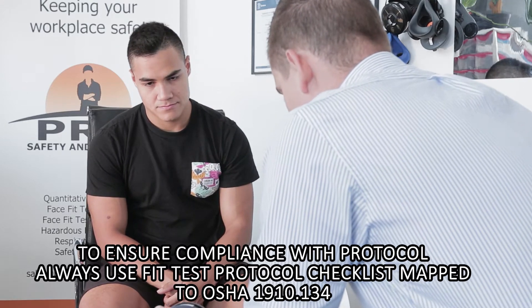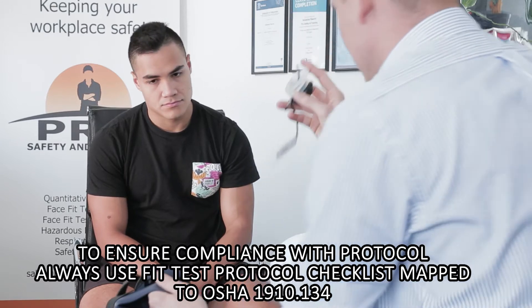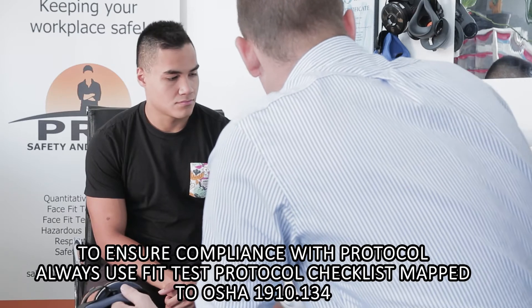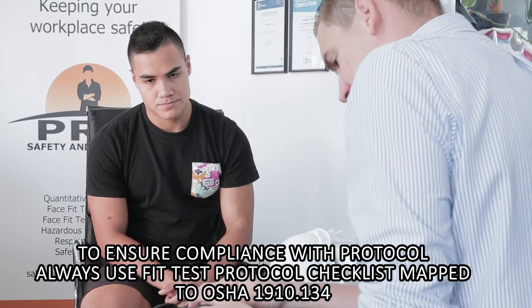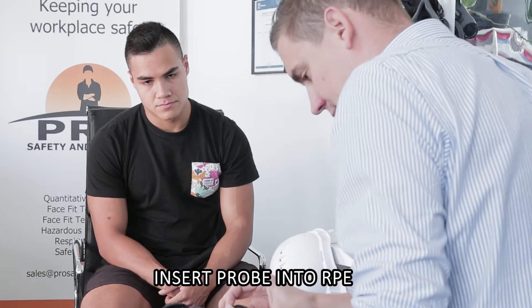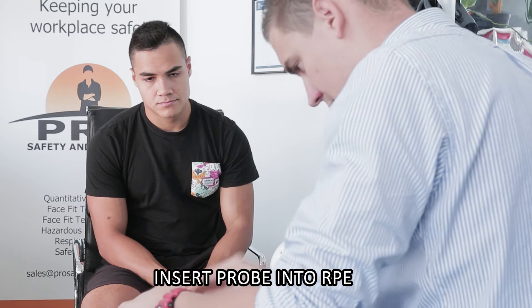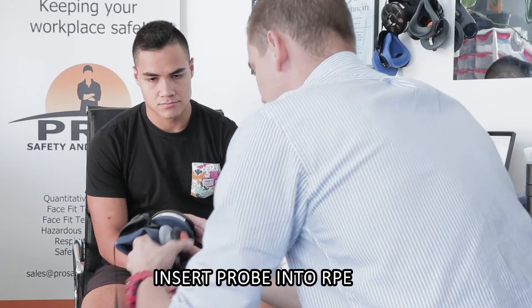I'm going to start off with the respirator itself. I'm going to take this off and get the valve or the probe installed. Please note when we finish the test, we're going to take this off and put that valve back on again. So please don't go walking out of here without the valve back on. I'm going to feed this through here. Excellent, nice and simple there.